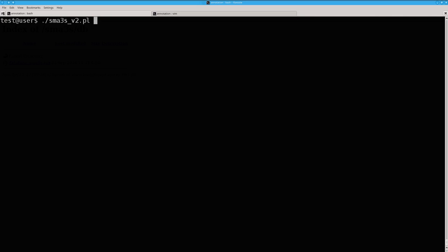As an example, you can annotate the query dataset using this command line. The input file, the database uniref90, and two additional arguments in this case.